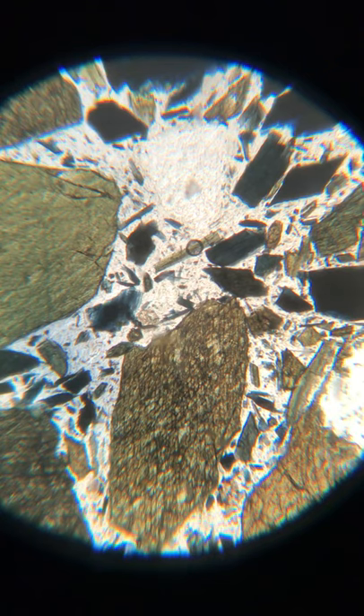Let's have a look at them in cross-polarized light.